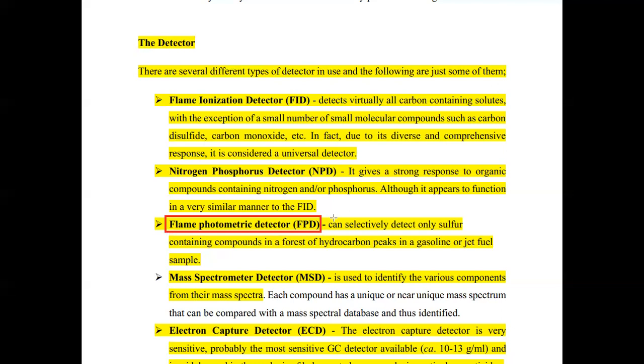I remember the water we were working on, I think, was Manze Valley. We were trying to detect the amount of sodium, the amount of chlorine, the ingredients you see on the bottle of water. Those are the things that we were determining, and the method we used was flame photometry.